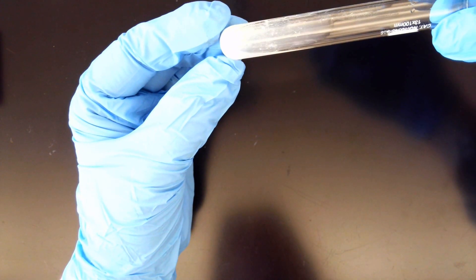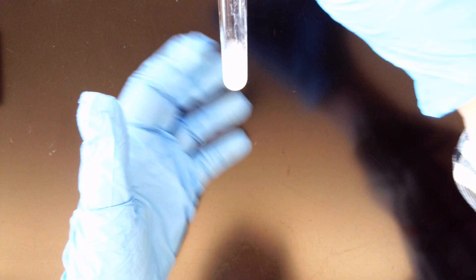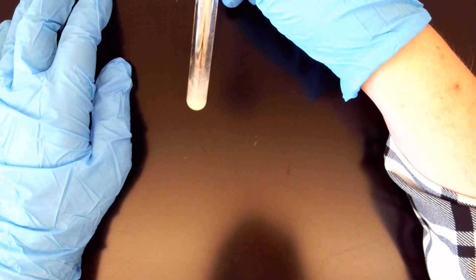all kind of sitting at the bottom, got a little bit of a yellowish hue to it. But our first one, here it is, is our precipitate.